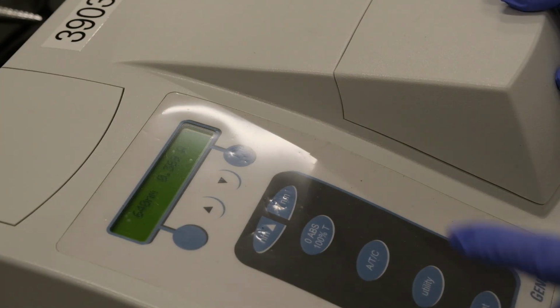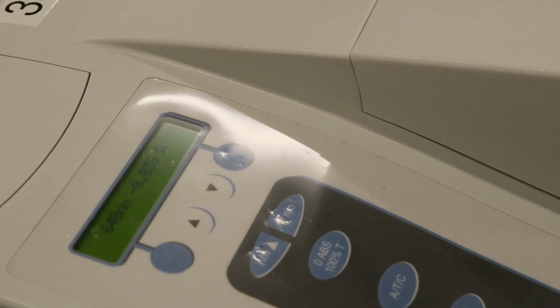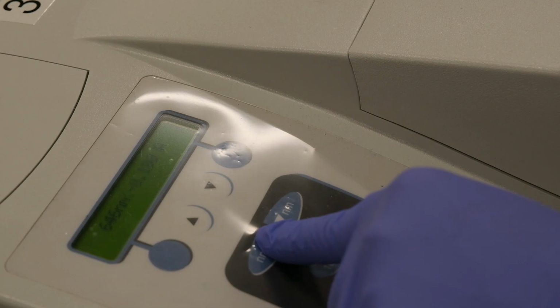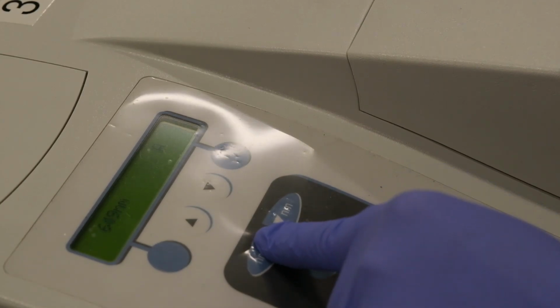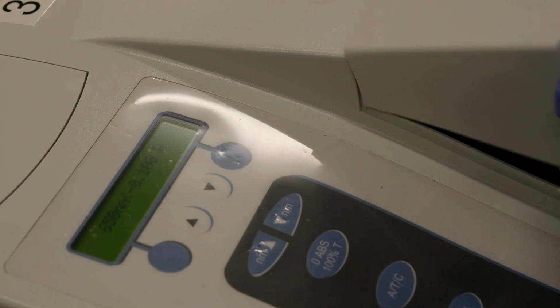Notice that now the absorbance is starting to decrease. So we increase 10 more nanometers. So we're already past our maximum.